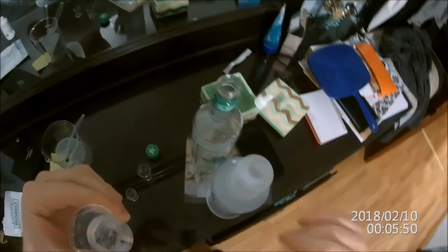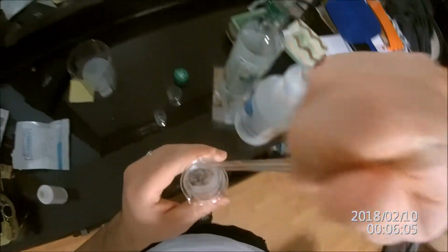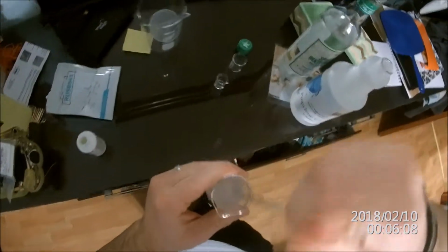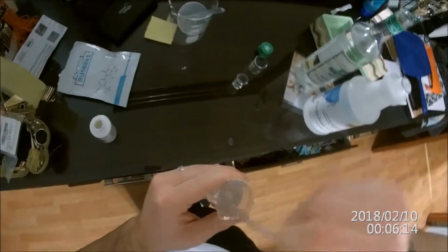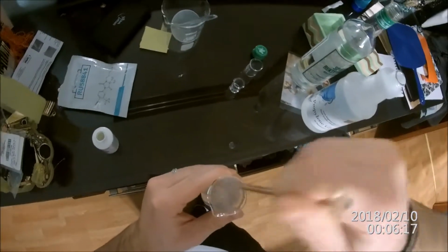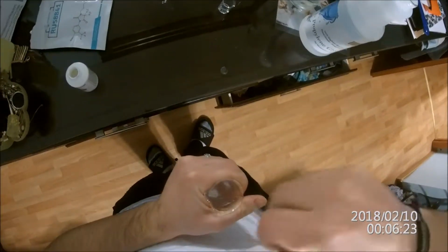And this, my friends, is 16 milliliters of solution, which is made up of 70% of this, or 11 milliliters of this, 30% of this, 5 milliliters of this, and 0.8 grams of RU, which makes it 5%. So now, we're just going to mix it. Careful you don't spill it. We need to mix this, and I feel some drops on my fingers as I mix it vigorously, so you want to try to keep it in there because it's expensive stuff.